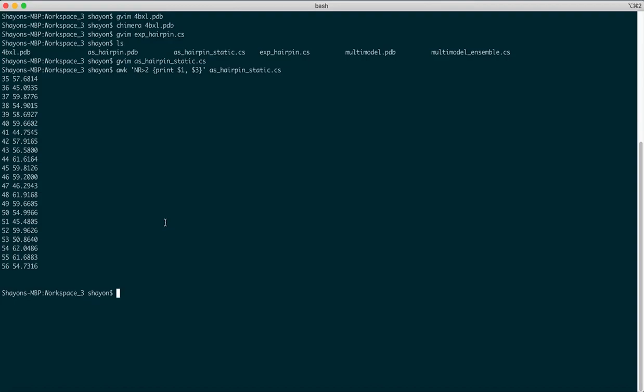Okay, so now we need to write this into a new file so that it's easier to access by the XMGrace program that we'll use to plot these chemical shift values and compare and benchmark them with that of the experimental values. Before that, as I said, we need to rearrange the residue numbers, which we can also do by including an additional command in this awk script.